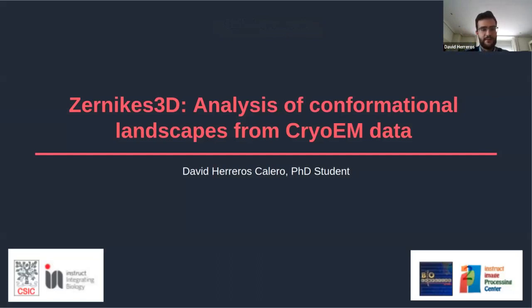My name is David Herreros. I am a PhD student in the biocomputing unit in the National Center of Biotechnology in Spain. And during this presentation, I will be talking about this new method we have developed, the Zernikes3D, which allows us to analyze conformational landscapes from our CryoEM data.